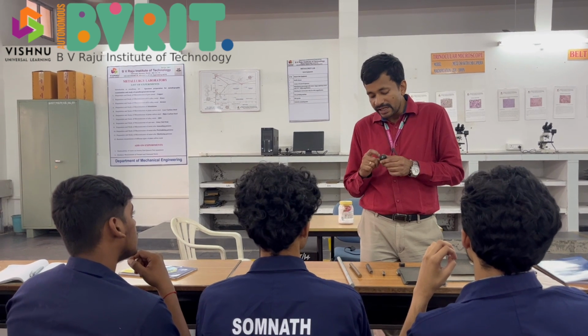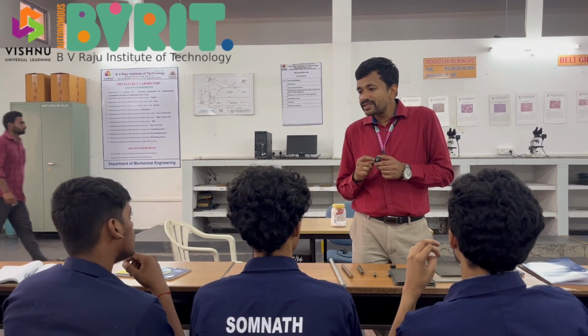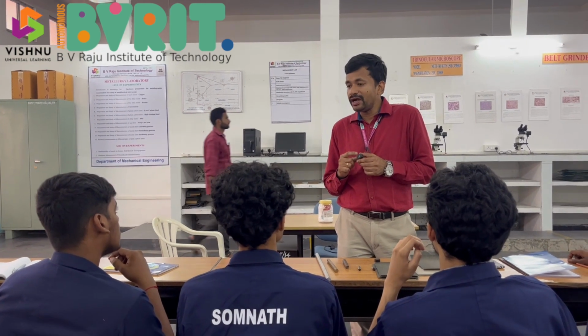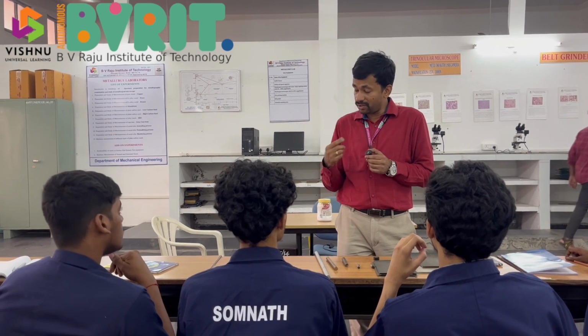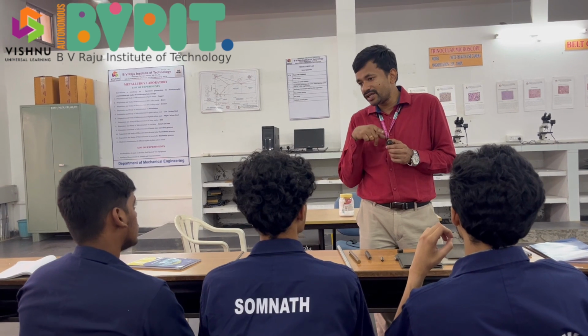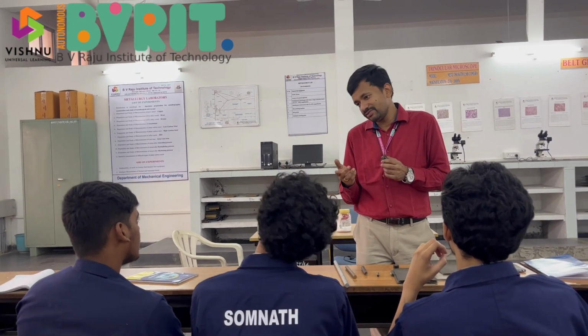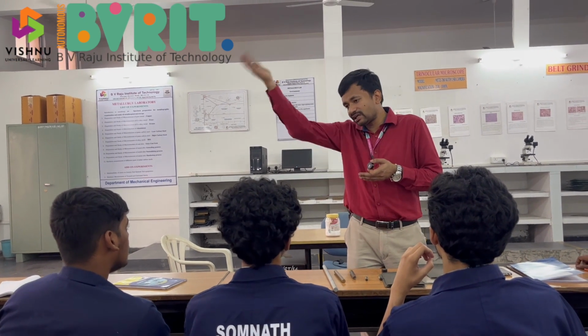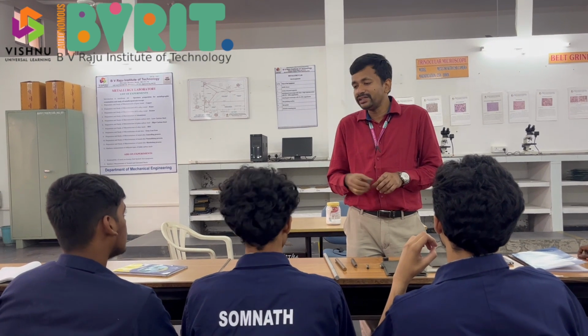So see, understand, this is a metal and this is something which is a polymer. So obviously this will not create any rupture onto the metal, nor will this be part of any polishing. So this is metal. So for metal only, try to get a harder thing to get that kind of scratches or any disturbance. So I think that should not be a problem.